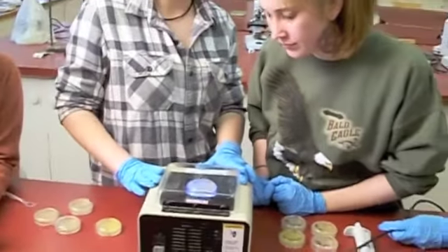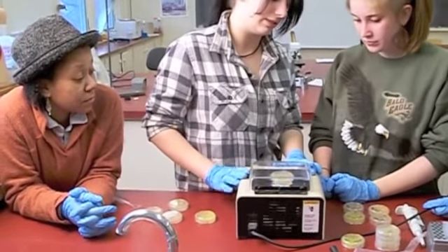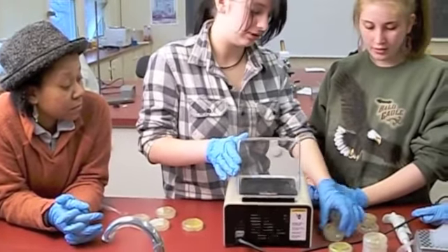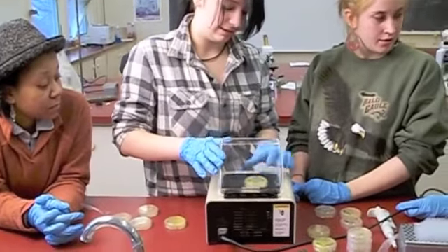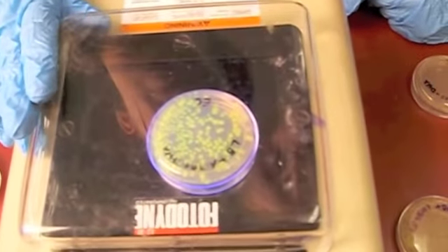This one is just blue. You can see it has a little bit of green. Probably there was some residue on the tip or something. Or just more blue. And this one's all green. Super cool.